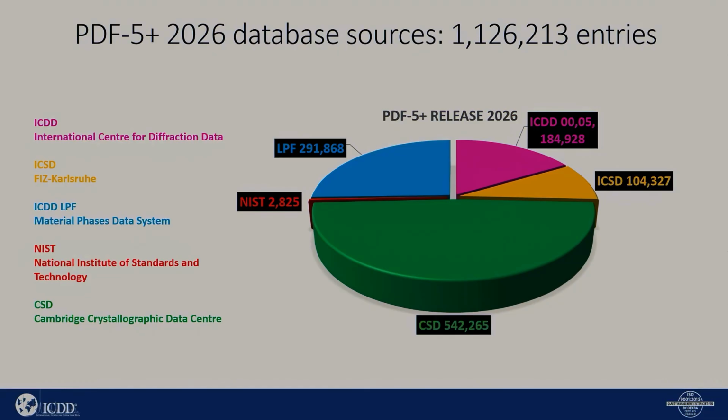Now, you'll notice, for example, in the CCDC data, they have also themselves over 1 million entries in the CSD. We do not put all of those entries in the powder diffraction file. Our focus is phase identification and quantitative analysis, so phases that you might find in terms of your analytical work. If you want to do modeling work with organics, you'll want the full CSD from CCDC.